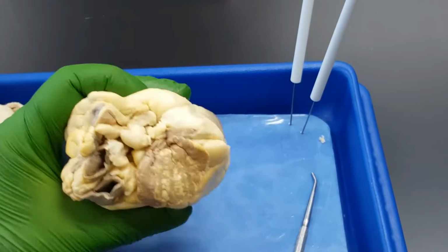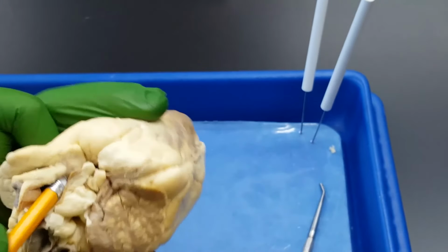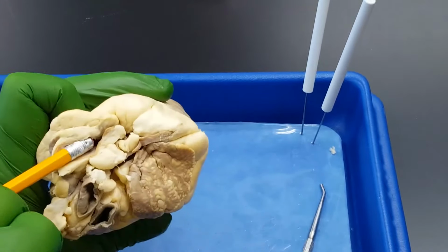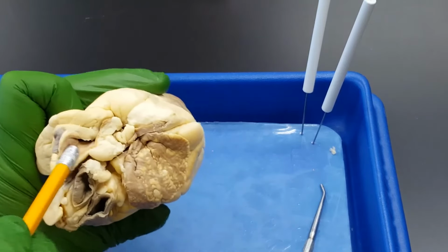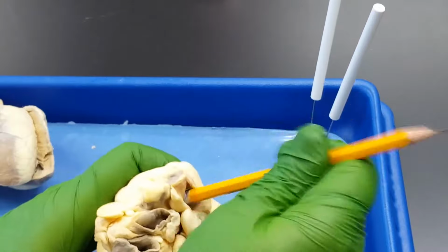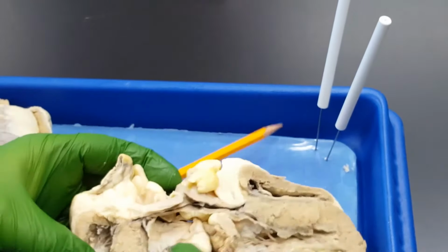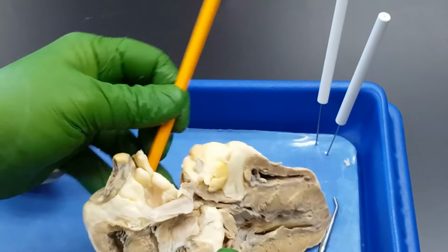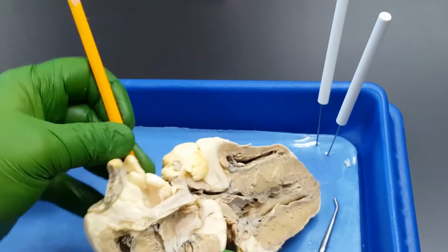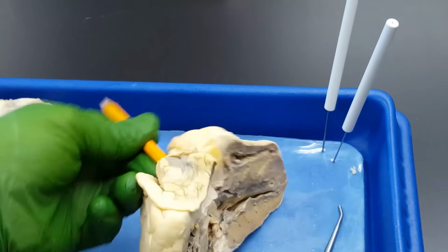I can see holes up here, but it's very difficult to tell where some of these holes are going. See, there's a great vessel cut right here. See this one? But I have no idea where that goes until I cram a probe in there. And now I notice, everybody, look at the pencil, look at the angle. I'm going to move it around in here a lot so you can see.